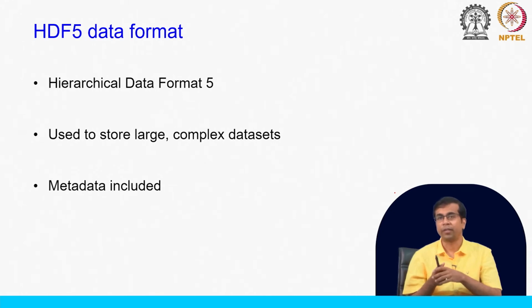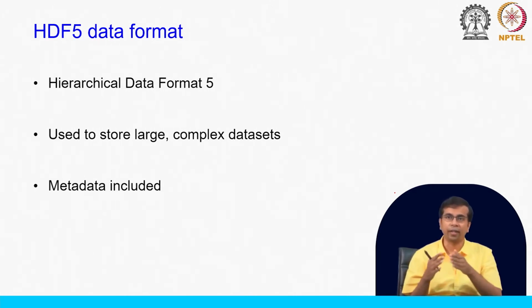As you have probably seen, in many cases we have this HDF5 format. We have seen in the case of SMRT that it used HDF5 earlier, and here also we are seeing FAST5, which is a variant of HDF5, a simplified version actually. The name HDF5 comes from hierarchical data format. HDF, and this is version 5, and you can also have earlier versions like HDF4. This data format is used to store very large complex data sets. It is not just for storing next generation sequencing data, it can be used for storing different types of data sets.